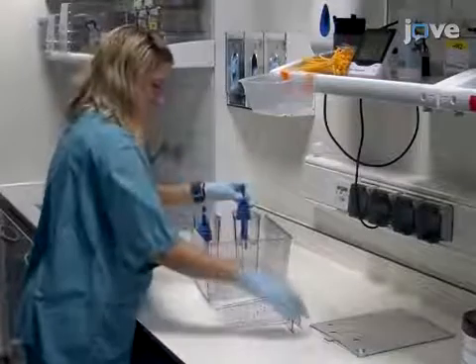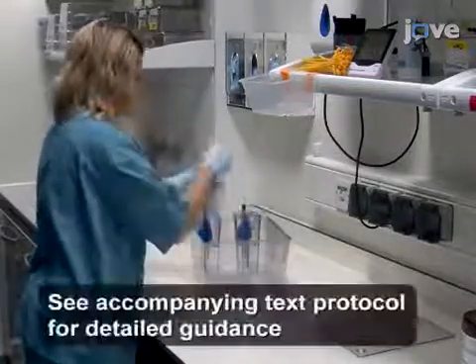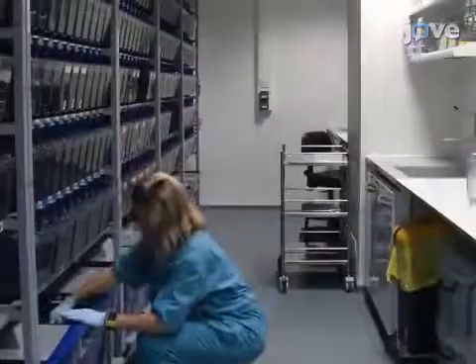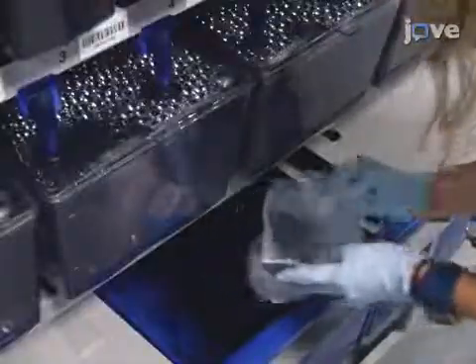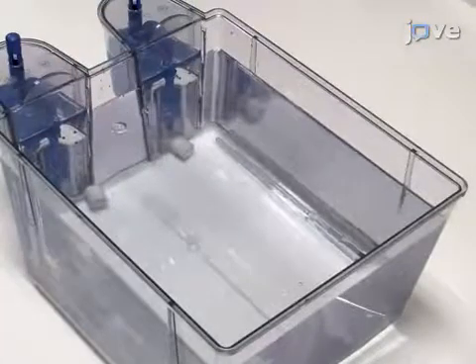To begin the protocol, set a clean 8-liter tank out of a recirculating system. Fill up the tank with about 8 liters of water sourced from sumps. Add two ceramic beads or sponge cubes of biomedia from the systems to screen.